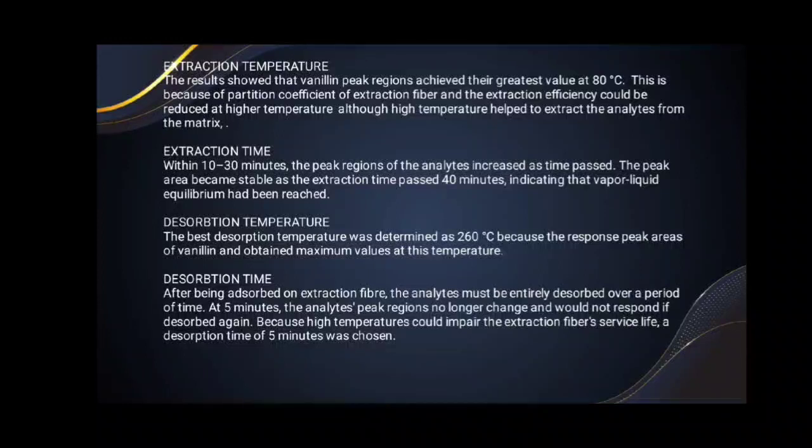Extraction time. Within 10 to 30 minutes, the peak areas of the analytes increased as time passed. The peak area became stable as the extraction time passed 40 minutes, indicating that vapor-liquid equilibrium had been reached.